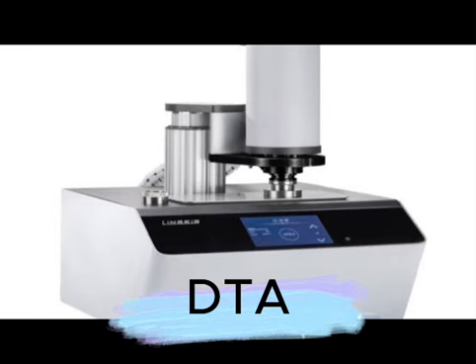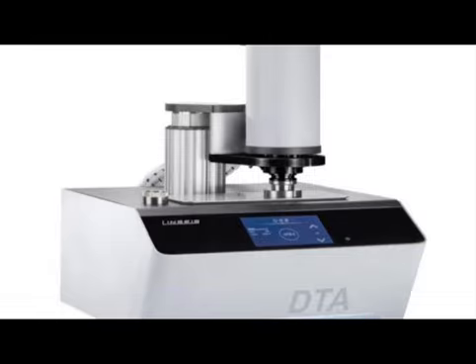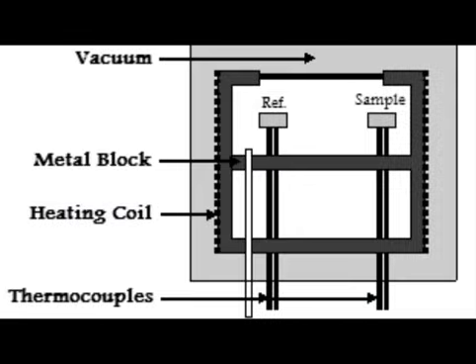The next is DTA, differential thermal analysis. It measures the temperature difference instead of heat flow. It gives information about the phase transition, melting temperature, crystallization temperature and so on.